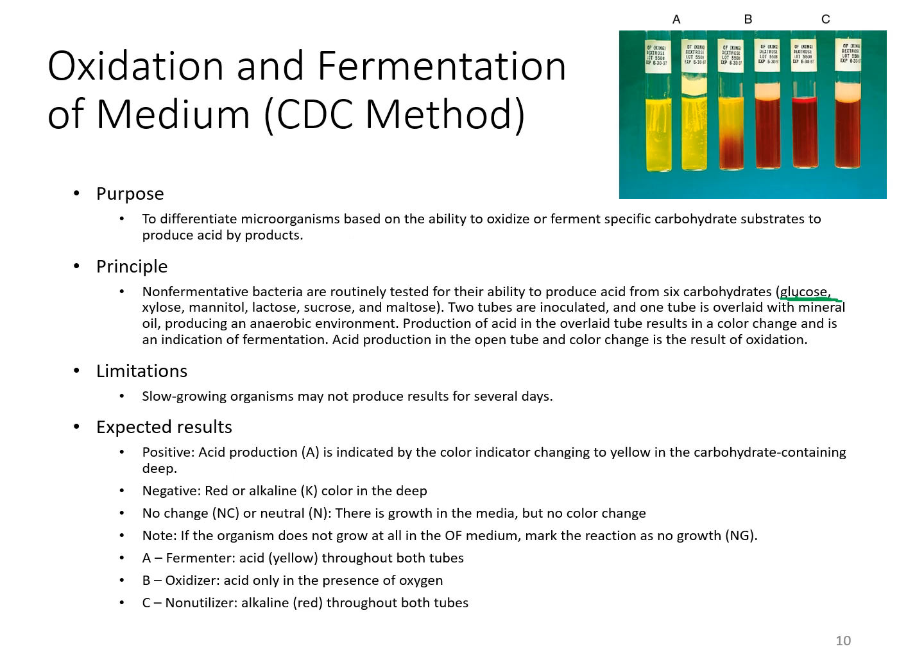So what you're looking for is you would take a particular medium that has that particular carbohydrate or sugar inside of that media, and you would take 2 of those tubes and inoculate both tubes with several stabs. You can see here up top where these organisms have been inoculated with several stabs into that media, and you can see where you have those little stab marks.